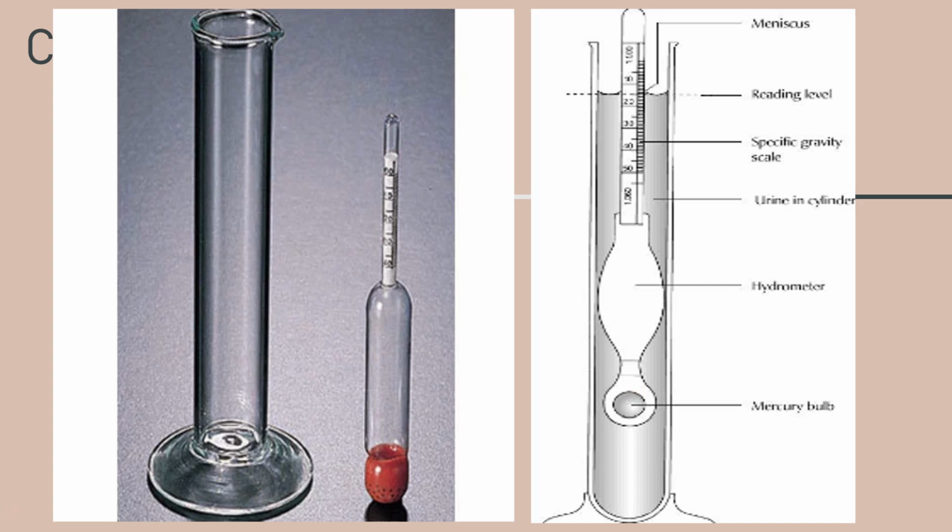Please note that your urinometer measures the specific gravity of your urine.